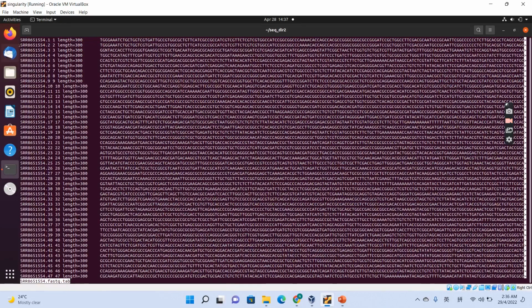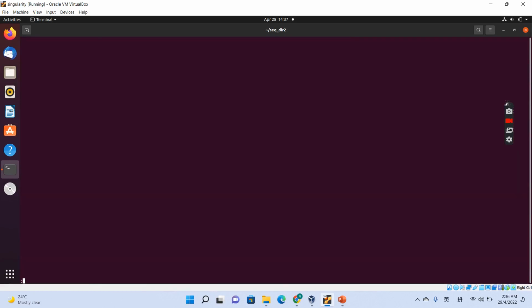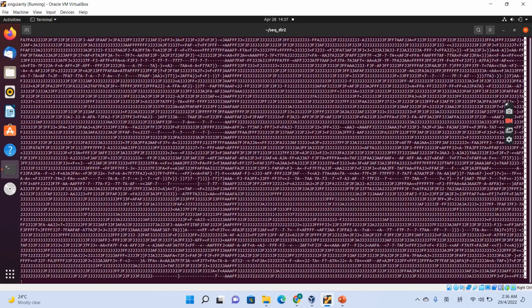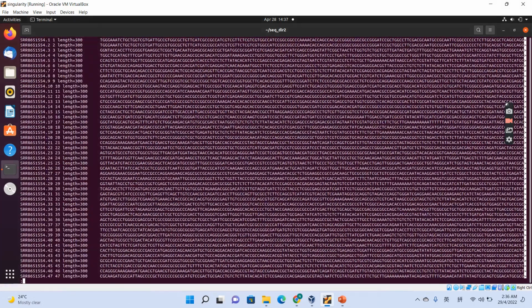So now you have output the 4-line FASTQ format into 3 columns. The third column is actually just a plus sign, so we did not output the third column. So we have output the first line, second line, and the fourth line as a 3-column tabular format.